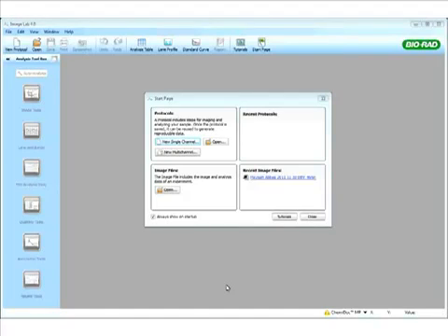Hello everyone. My name is Ben Samabassi, field application scientist with Biorad, and today I would like to talk to you about image acquisition using our newest imaging system, the ChemiDoc-MP.